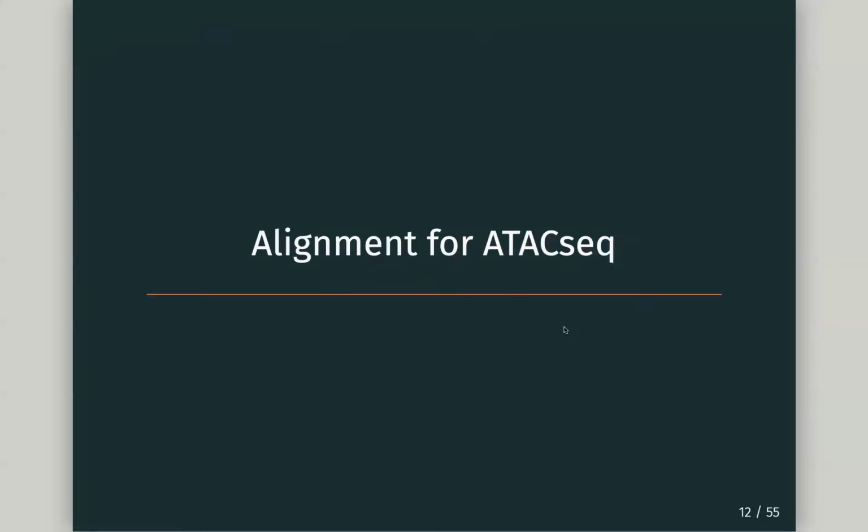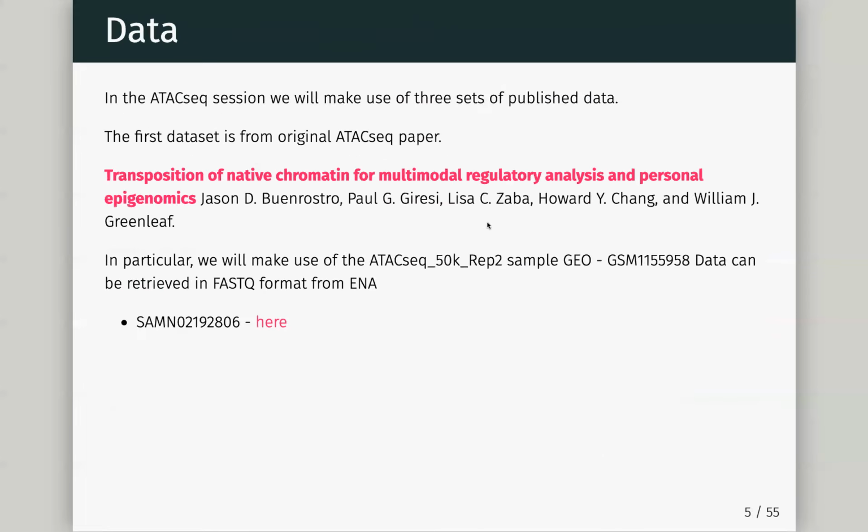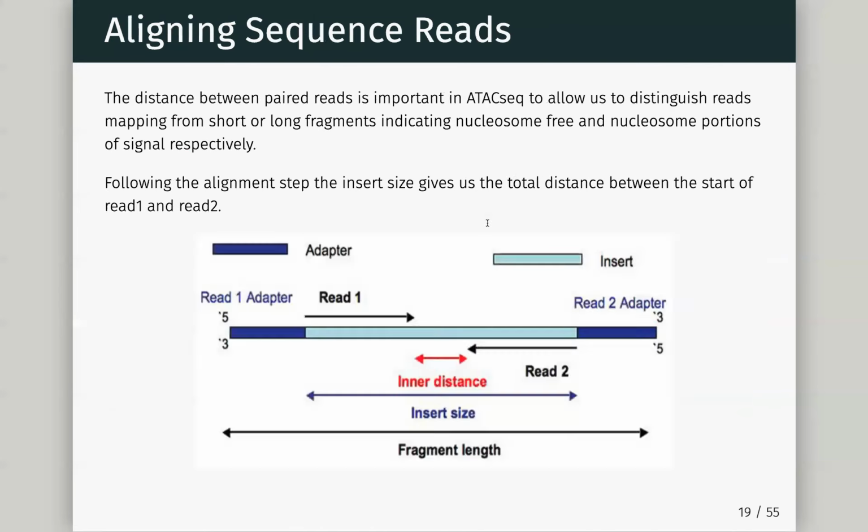So these broken up bits of DNA here, those are what we're sequencing. And then we'll add the adapters, and then read 1 will start from one side and read into the fragment. And then in the sequencing, we'll flip this, and then we'll read from the other side, going backwards across the fragment with read 2. So you can imagine quite often read 1 and read 2 may overlap in the middle, if the fragment is short enough. We'll get an idea of this. We should have sequence which matches.